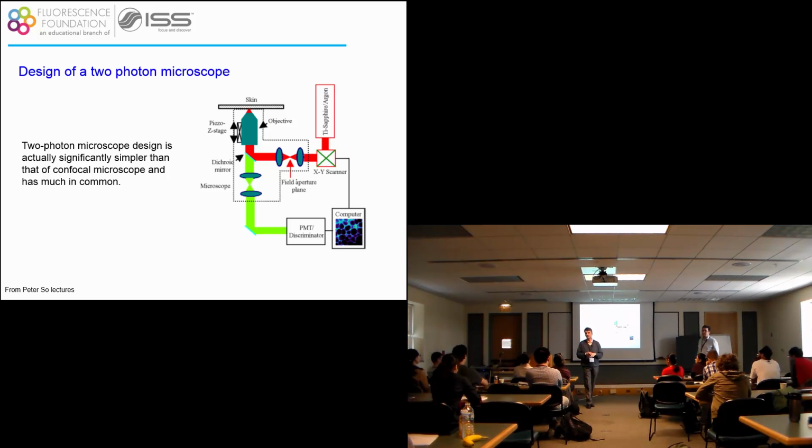And it's important, for instance, when you calculate the volume using two photon for fluorescence correlation spectroscopy; you need to characterize the shape of the point spread function in order to get the volume of illumination of your sample. It depends: if you use a single photon laser excitation, it is a 3D Gaussian. If you use multi-photon excitation, it's Gaussian laterally, but it's Lorentzian on the z-axis.